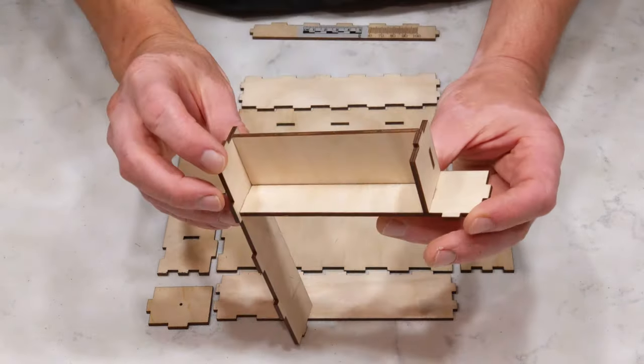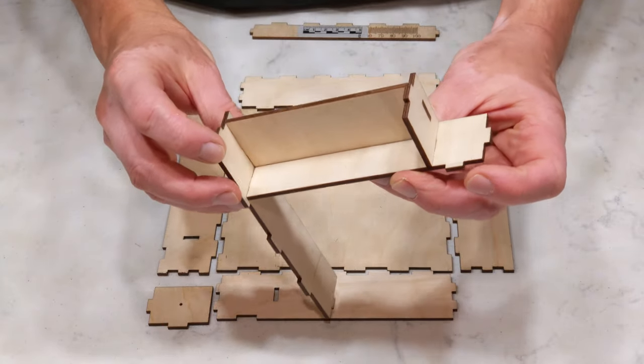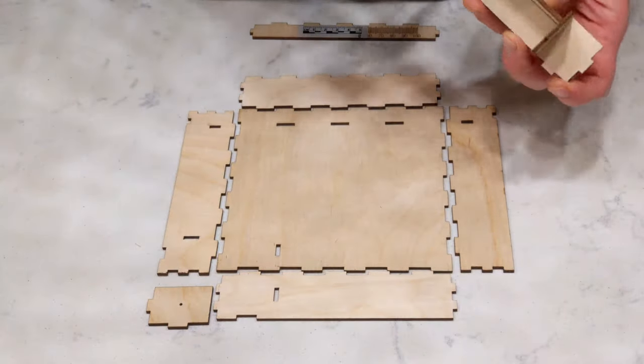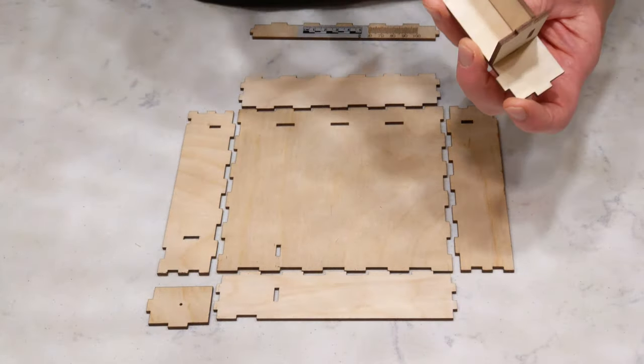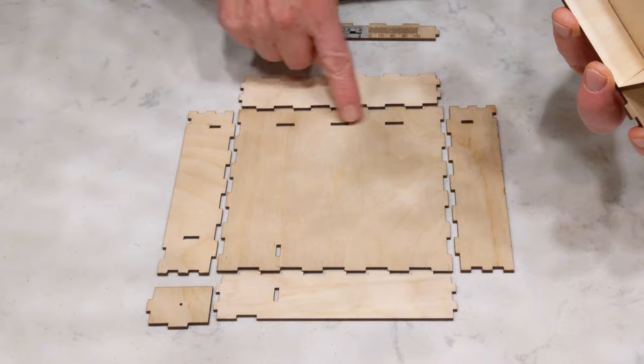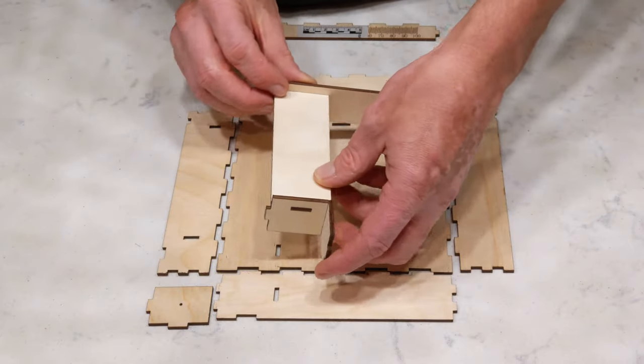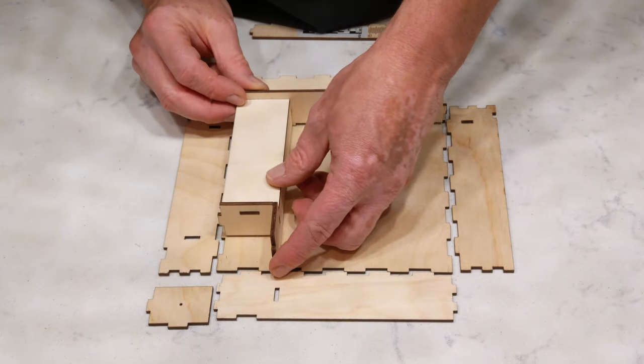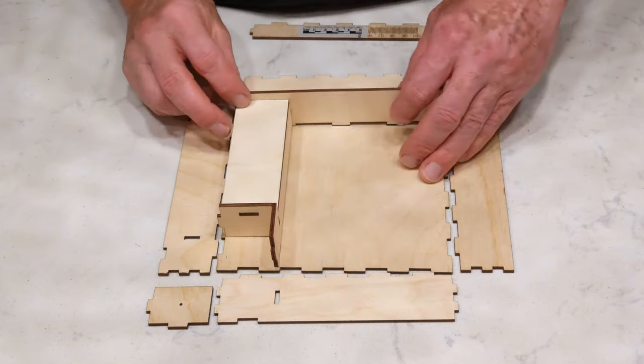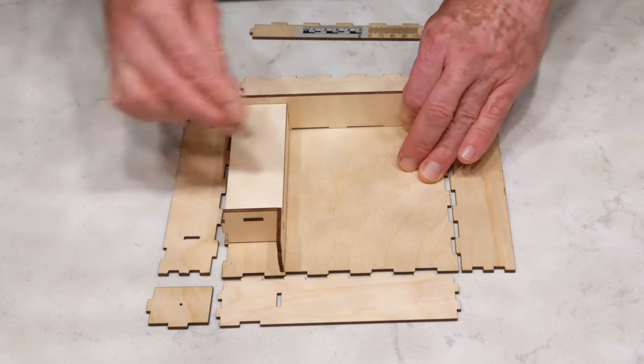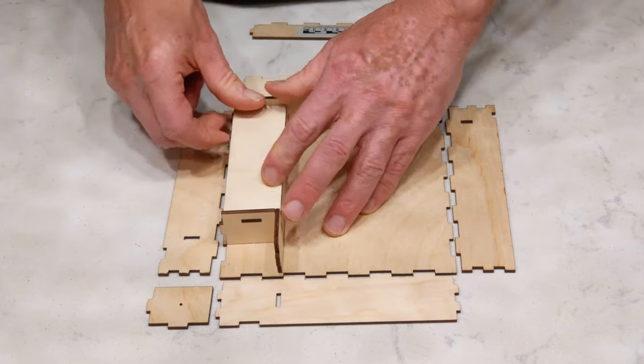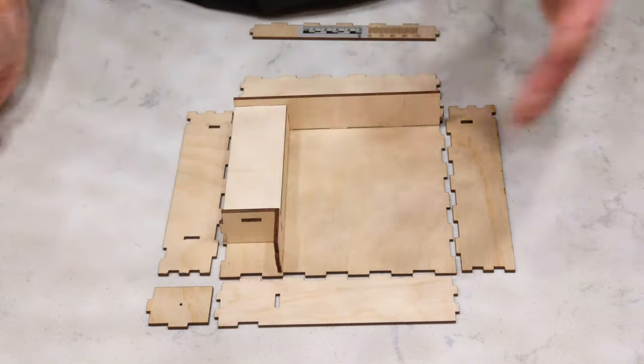You'll notice on the bottom there's a couple of tabs here. Those fit in right here and right along here. So I'm just going to set that in place. Pop it right down in there.